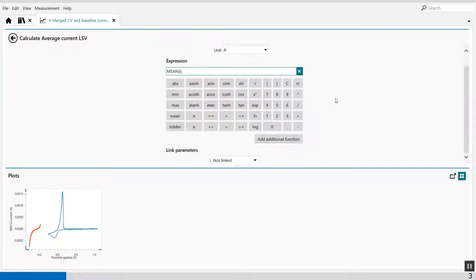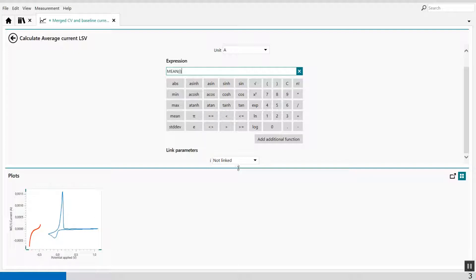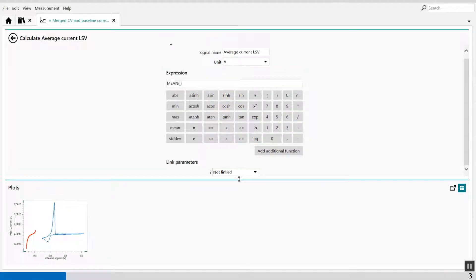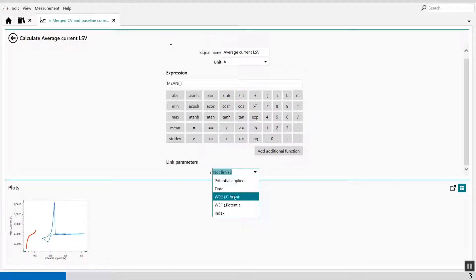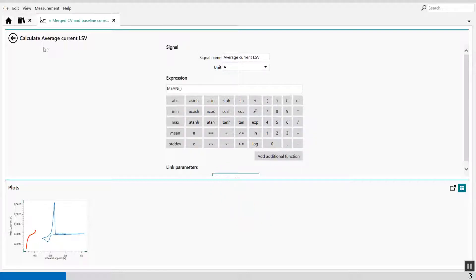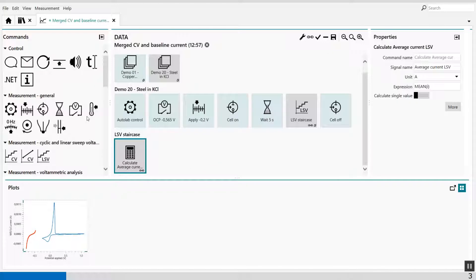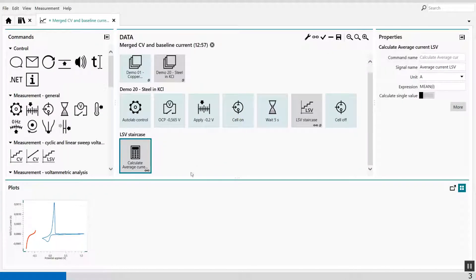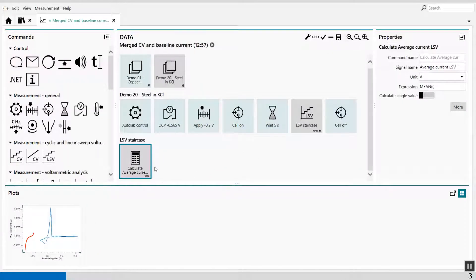Once I've set the value, I can link it to the measured signals from the LSV. And in this case, it's the working electrode one current. So now I have calculated the average current of this LSV.